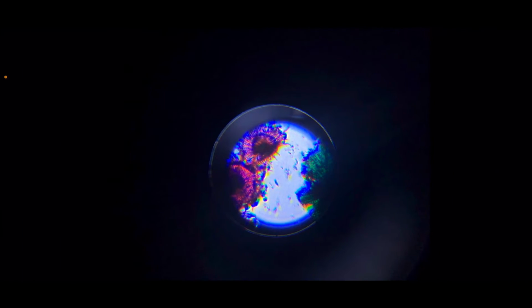Without the dye, they most likely appear to be uncolored or clear, because they don't usually come in colors, just like our cells. And you can see that we also have some green stuff going on, and this one just really shows the neon colors around it, which we can explain with color theory.